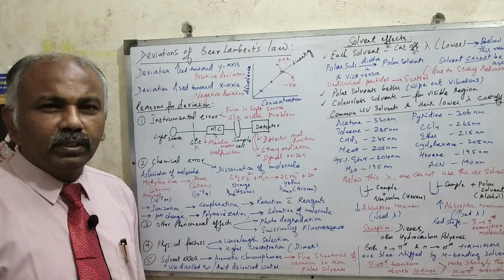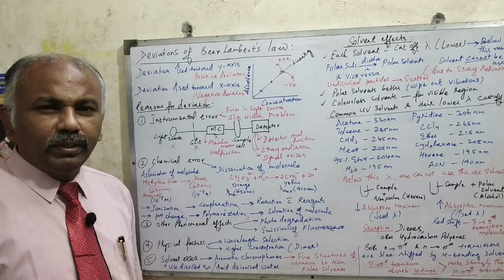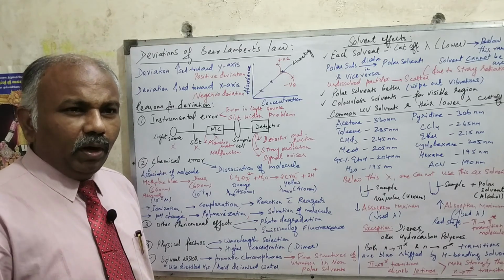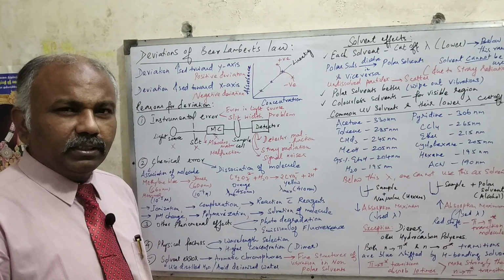Today I am going to discuss the various deviations of Beer-Lambert's law, as well as the effects of solvents in UV visible spectroscopy. So in my session today, I am particularly focusing on reasons for deviation of Beer-Lambert's law.